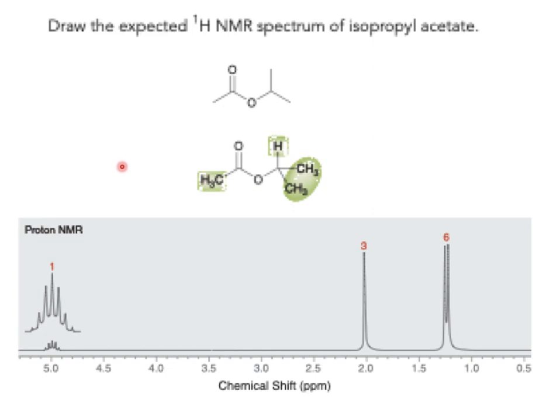So this is also the proton NMR of isopropyl acetate, right? How many different types of protons? 1, 2 and 3. That's why it has 3 signals. The most shielded one is these methyls, right? And after this, this one. So three different types of protons, right? This one is the most shielded, this one is the second most shielded, and the most de-shielded one is this one because it is attached to the oxygen, right?